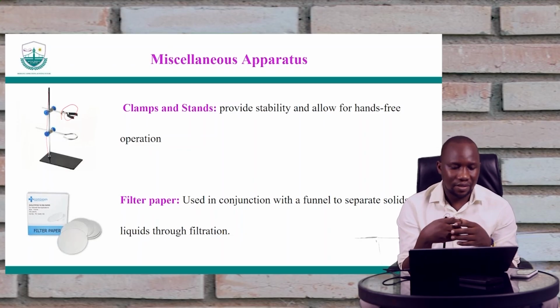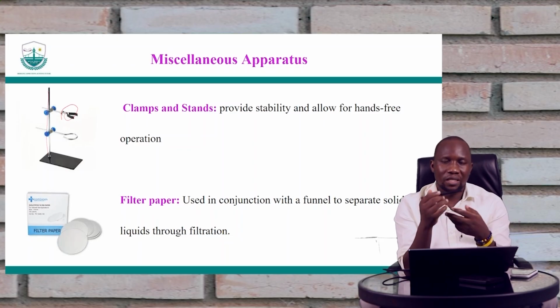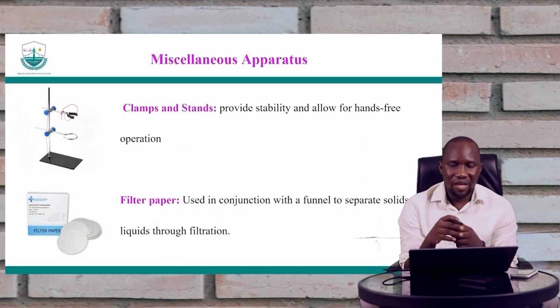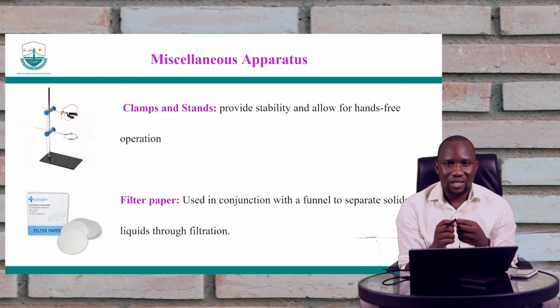other apparatus. And then the filter, okay, if you want to separate, for example, a mixture that contains a liquid and solids. Okay, so that basically marks the end of this presentation where we have looked at the laboratory and the different apparatus and their uses.